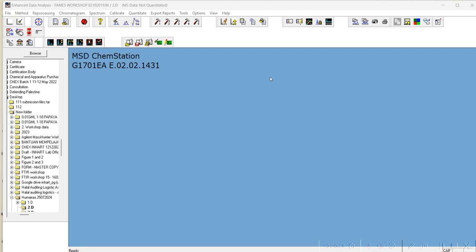Okay, so for today I would like to share about the simplest way, or what we call the preliminary way, I analyze any chemical compounds or components in an extract, whether it's plant, animal, or sometimes an extract that came from bacteria, for example. So usually for me, I'm quite used to the GCMS brand of Agilent.